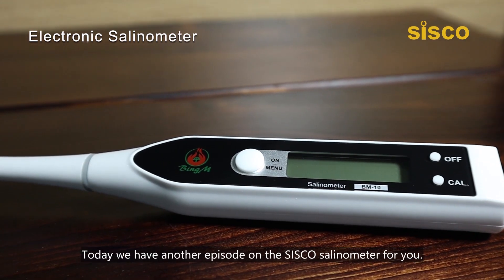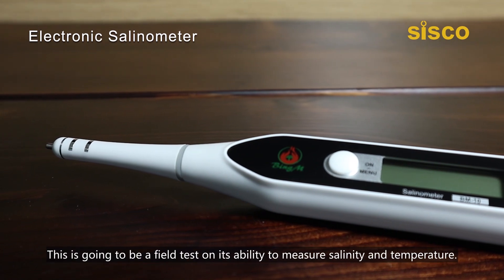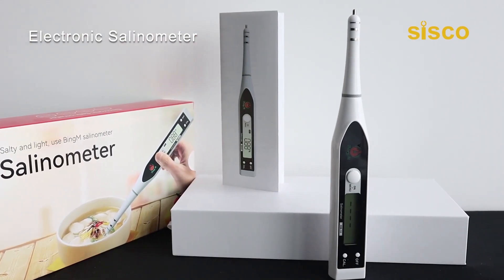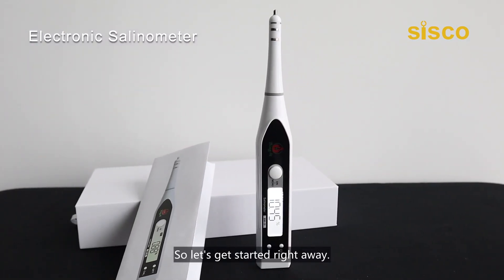Hello everyone, welcome back. Today we have another episode on the SISCO Salinometer for you. This is going to be a field test on its ability to measure salinity and temperature. By the way, we've already had this tester calibrated, so let's get started right away.